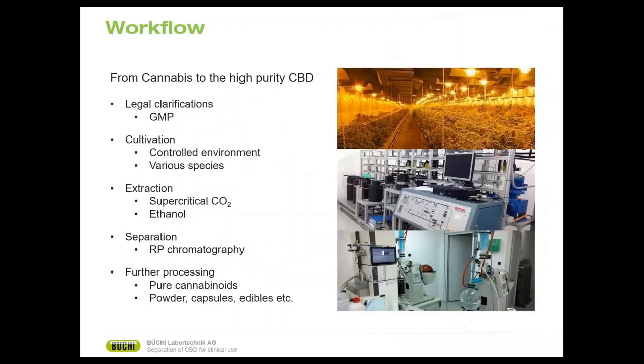So let's start with the workflow. Let's start with the workflow, how to purify cannabinoids starting from the plant. Before digging into the production, planning, and everything, we must consider what we will do with our end product. Depending on our customer, we must choose to have or not to have a GMP regulated plant.